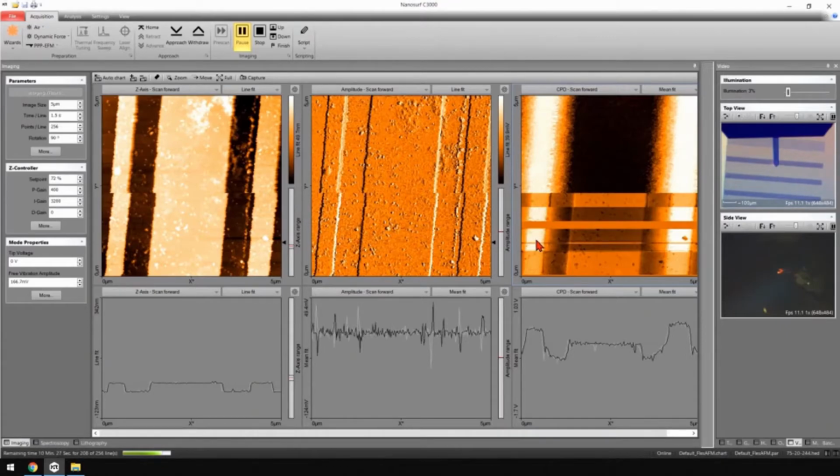So now this lighter area corresponds to a higher value of, well, now I went back to 0 actually. But this used to be 1 volt. And the nice thing is that whenever I'm changing a bias, even if it can be fairly abrupt, even if it's from 0 to 1 volt suddenly, you see that the topography just continues as is. It's totally unaffected. So there is no leakage or contribution of the electrostatic in the topography, so that we can be assured to measure the true height.